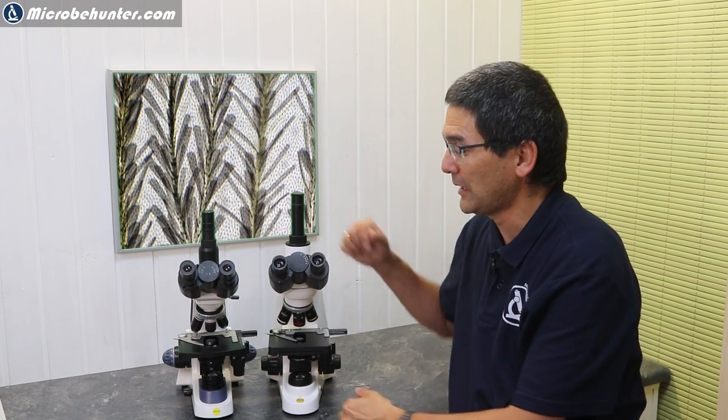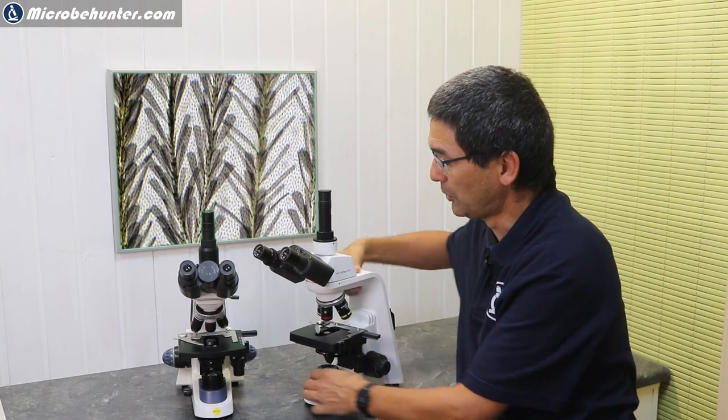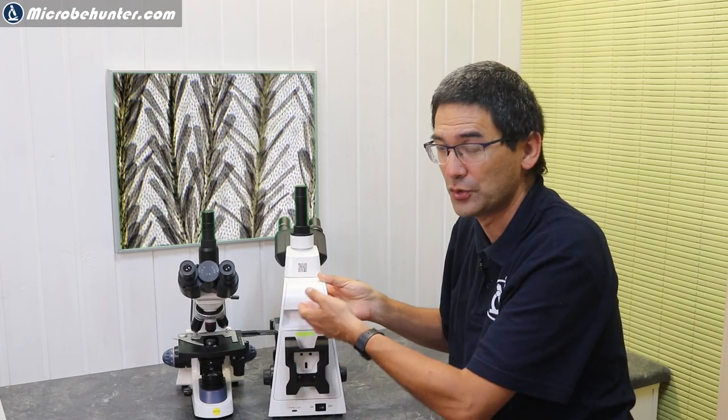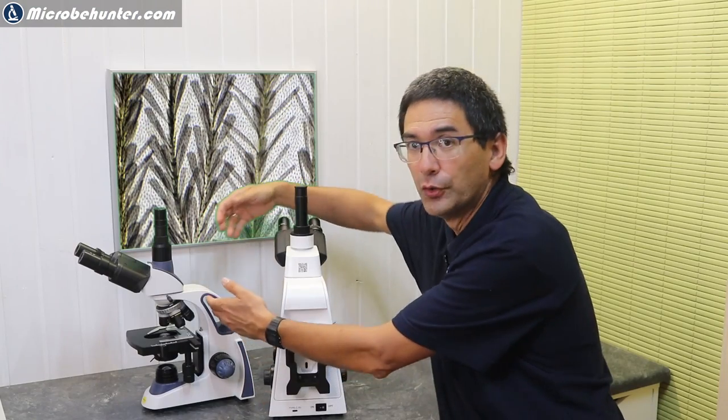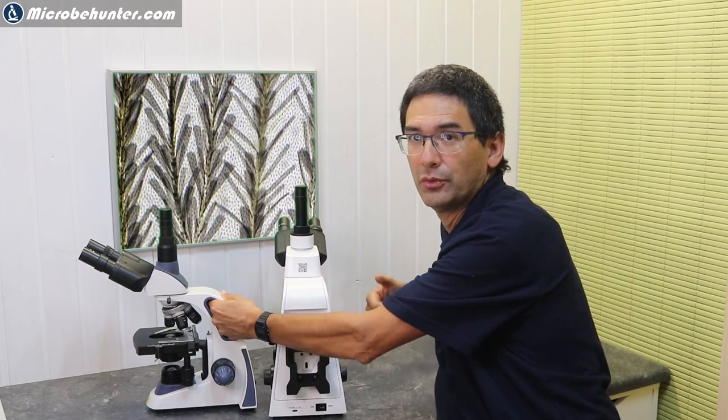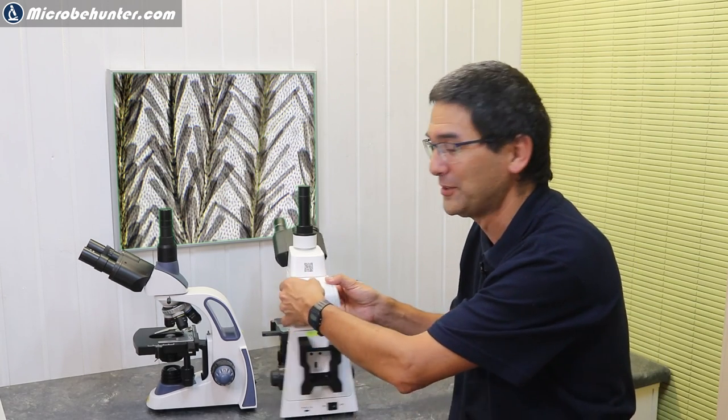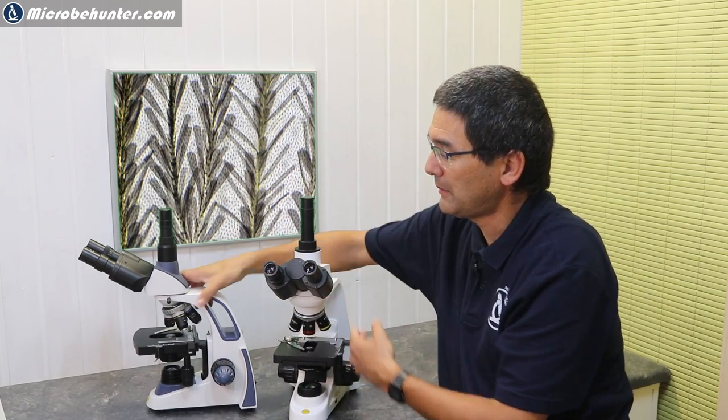Another difference here that I would like to talk about is about the possibility to carry the microscope. Here you can see that this microscope here has, you know, you can hold it here in the back, while the other one has a vertical opening where you can put your hand through to carry it. That is a question of convenience and personal preference. I generally do not recommend that you carry microscopes around of this size. They're generally, with over four kilograms, relatively heavy already. They have to be heavy because they have to be stable. Leave them on your table, find a place and leave them there ideally. But of course sometimes it's necessary to carry them around as well.